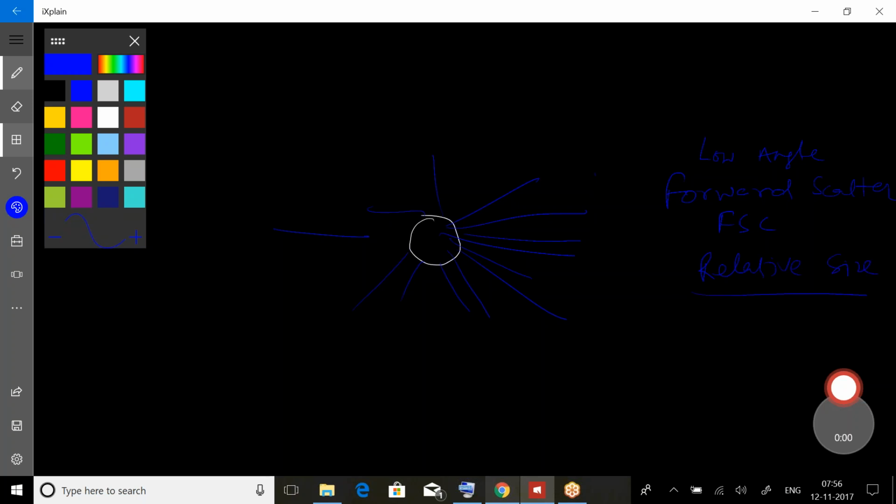If we are running two different types of particles, forward scatter is not necessarily going to tell about their relative size. The other thing that differs is the refractive index, because the particle has got matter, it has got materials. If it is a cell, then there is a nucleus inside, there are granules, there is the cell surface, the cytoplasmic membrane. These all interact with the light.